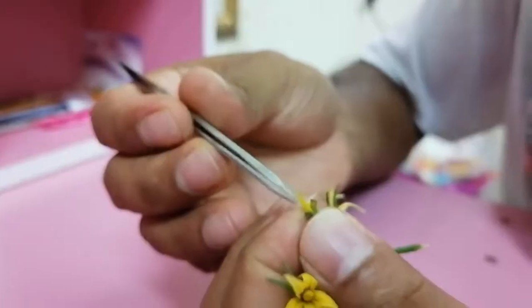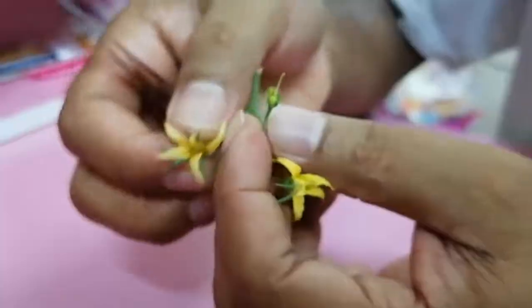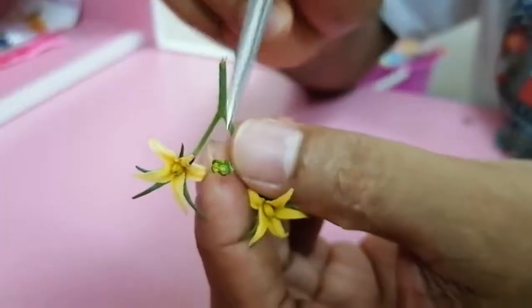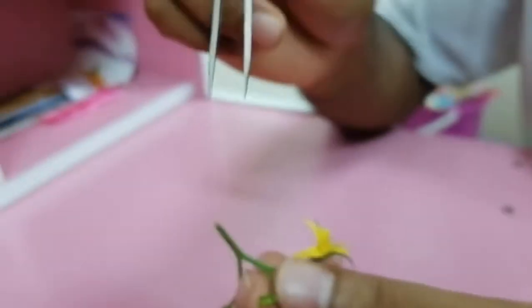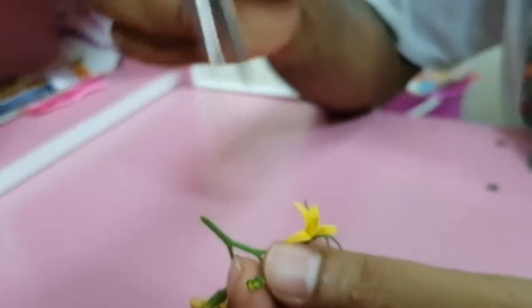Now I have removed all the sepals and petals. Only the stigma with the long style remains. This is the emasculated tomato flower. Since it will open tomorrow, we have to bag it — we use the zip-lock bag and cover it today, and tomorrow morning when other flowers open, we can bring them for pollination.